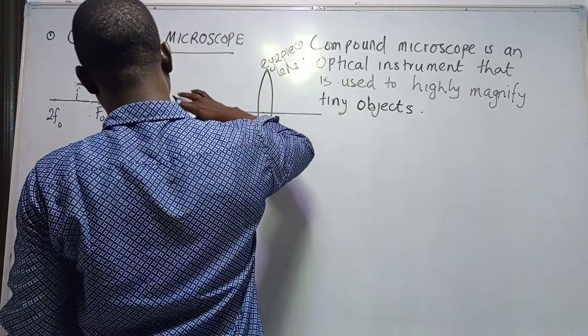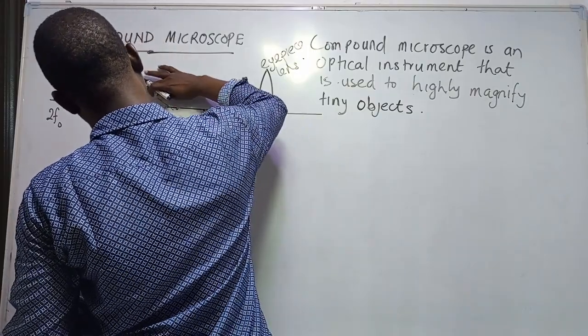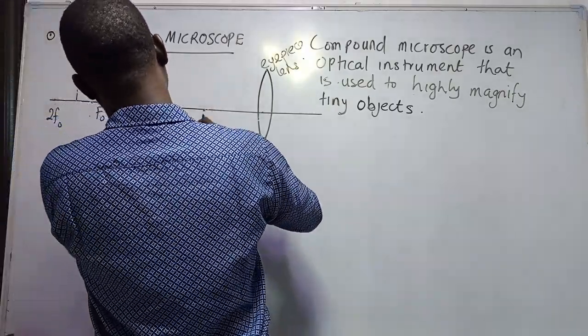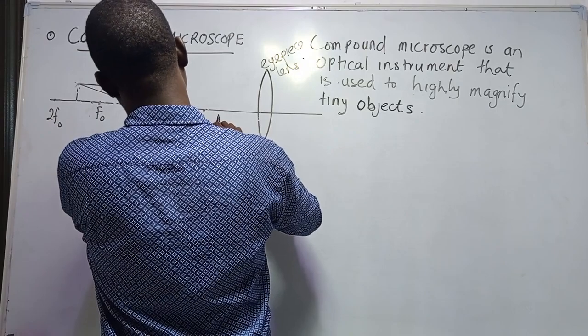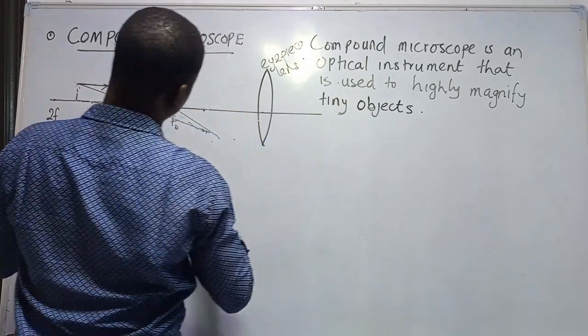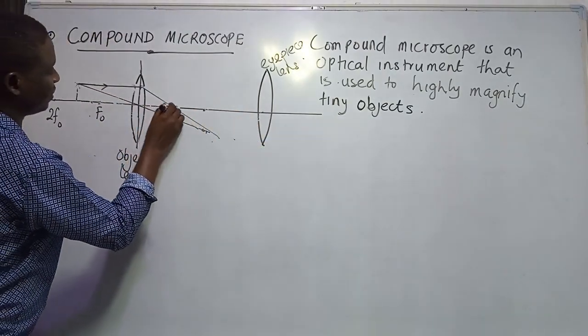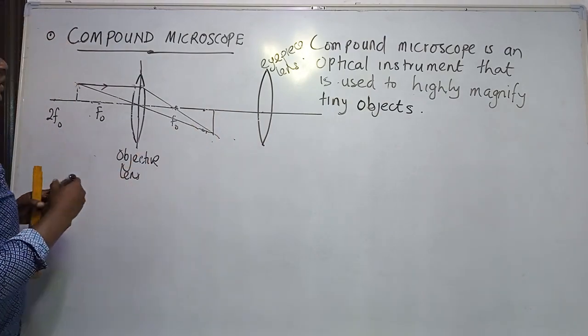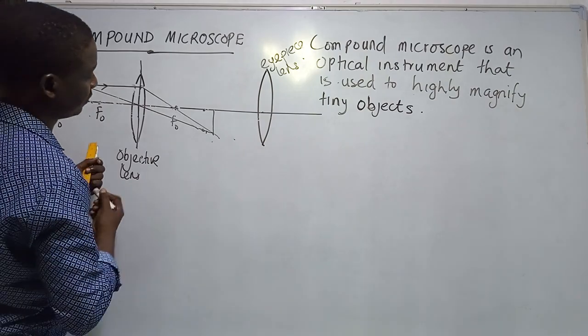So this is where the image will form. The image will form there.